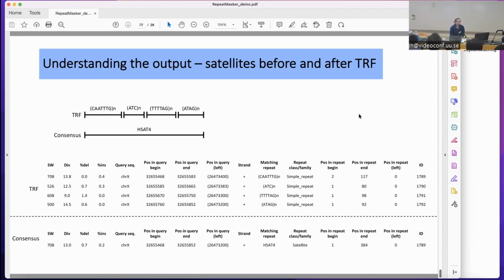So the Smith-Waterman score depends on a bunch of different things. It's dependent on the length, on gaps and mismatches, so a lot goes into it. For example, a really high scoring Alu match is not going to score nearly as high as something that's a lot longer. So it depends on the size a little bit, and I can talk about the specifics of that calculation a little bit later.